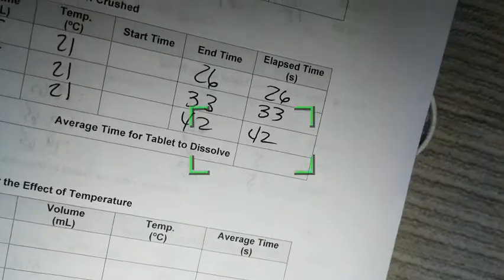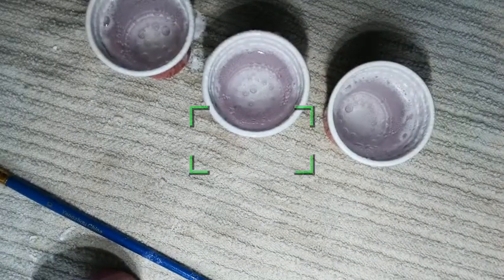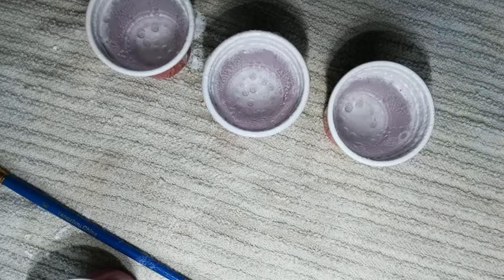So that is the data that you'll be getting from your crushed tablets. Remember, you're going to compare those to data table A, which is the whole tablets at 21 degrees that we did earlier. Those are those 3 from the surface area. All right, so that's all the data. If you got your data from me, that's all you'll need. And then, like I said, in the earliest part, you're going to use that information to complete the lab write-up that we went through earlier in the beginning of our video.